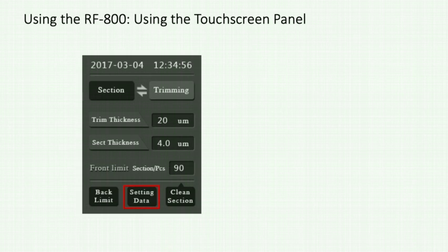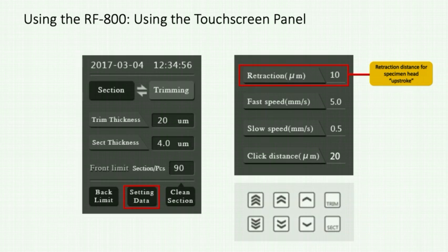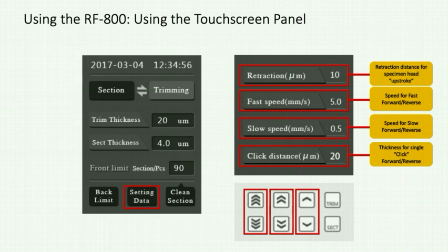You can also push setting data to see another window of features. In this window, you can set the retraction distance at the very top. For example, we have set the retraction distance to 10 microns in this picture. Now below is where you can set the different speeds for moving the specimen head forward and backward. These match the buttons on the control panel. You can set the speed for fast, slow, or click speeds.